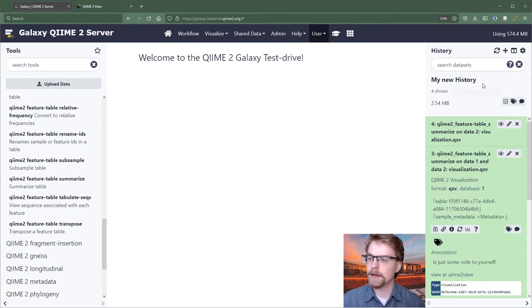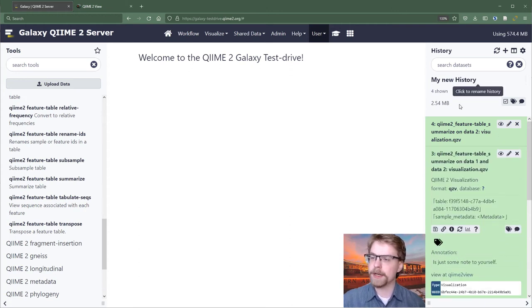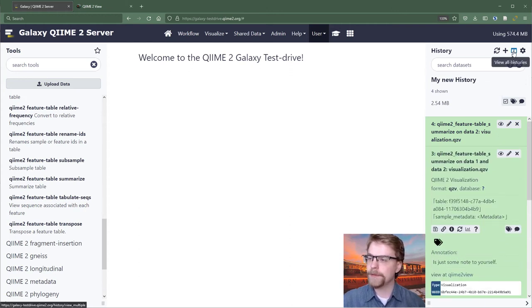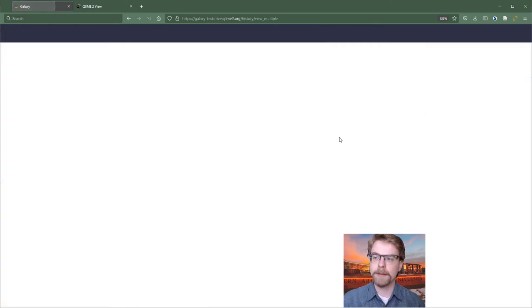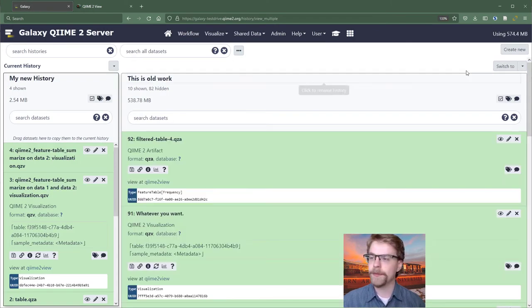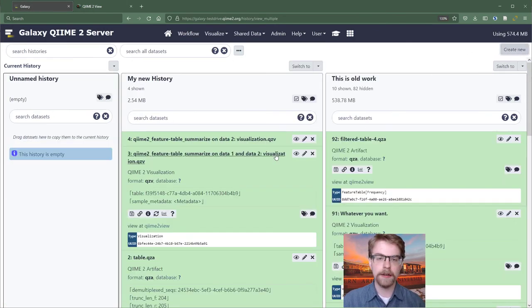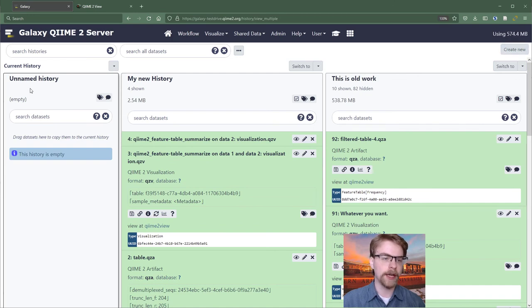And that's basically it for interacting with the history. We can look at history. We can rename history. We can swap histories and create new histories. So I could create a new one here. And now I have an unnamed history.